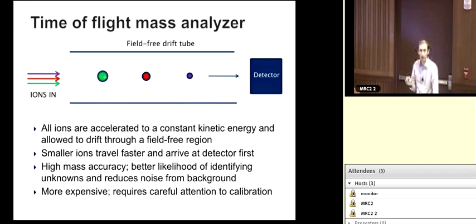So when you're thinking about your buffer rinse, your last sample prep steps, you'll consult with the core, you'll look at our sampling guidelines, and you'll see things that are designed to help minimize this problem. If you can't get rid of it, we may still be able to work with it. So don't give up hope. But it's just something to be aware of.